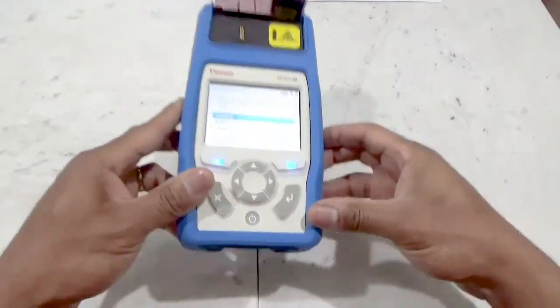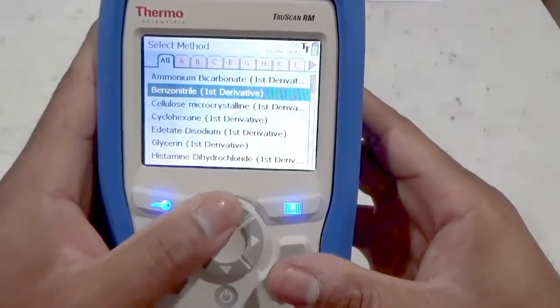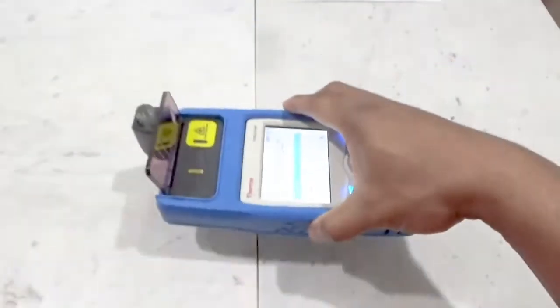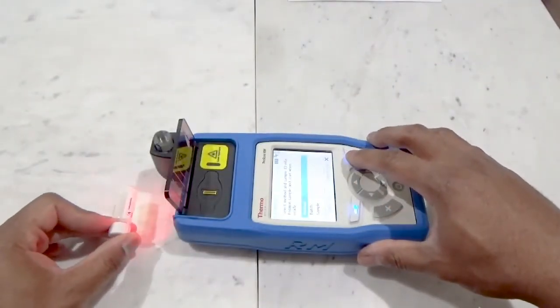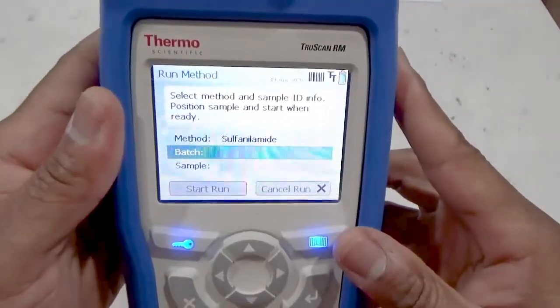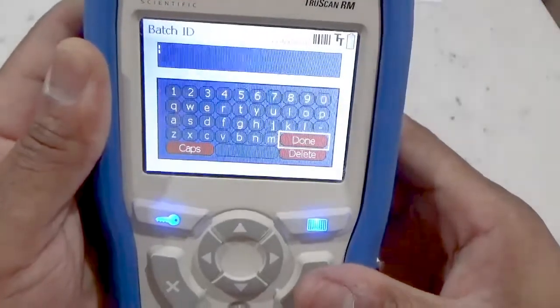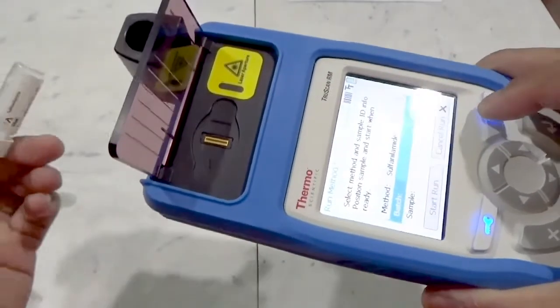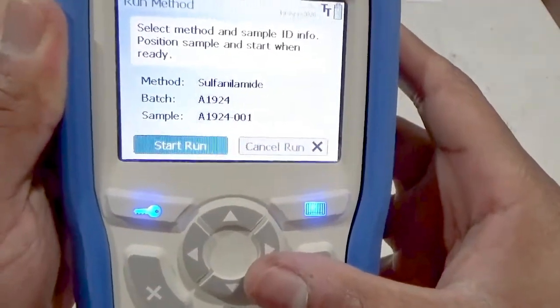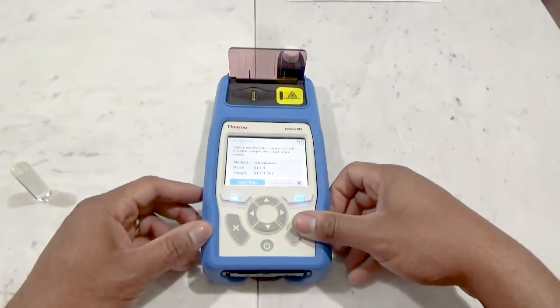Select the run function and press enter. The method field is highlighted automatically. Pressing the enter button will show the list of validated methods currently on the analyzer in alphabetical order. A faster way to select your method is to use the barcode scanner — when a field is highlighted and the barcode icon is displayed, that field may be entered using the barcode scanner. Scanning the barcode associated with the sample method will pull up that method for immediate use. The batch field is now highlighted; one may manually enter a batch ID or use the barcode scanner. Once the batch ID is entered, the sample line is automatically entered using the batch ID and a counter appended to it, allowing a user to immediately identify both batch and scan sample. Once the sample line is filled, start-run becomes illuminated. For this demonstration, I'll use the vial holder and seat the sample.